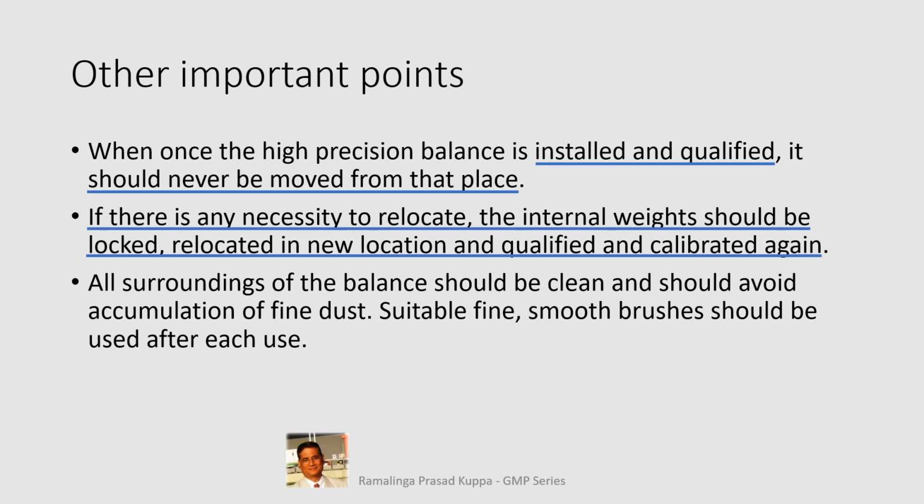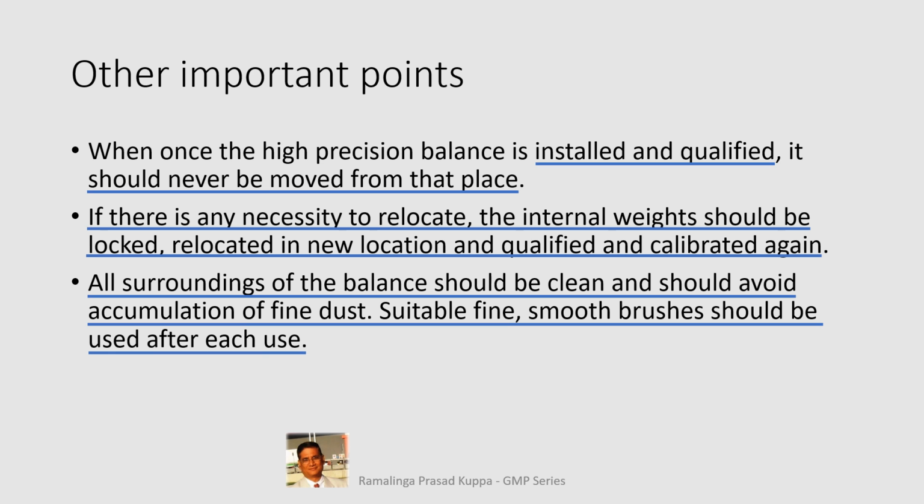All surroundings of the balance should be clean and should avoid accumulation of fine dust. Suitable fine, smooth brushes should be used after each use. Never leave all the doors of the balance open when not in use. Do not throw paper garbage around the balance. Safely drop all the used weighment butter papers into the dustbin. Keep the surroundings and the inside of the balance clean always.